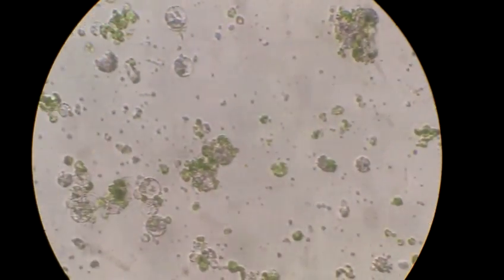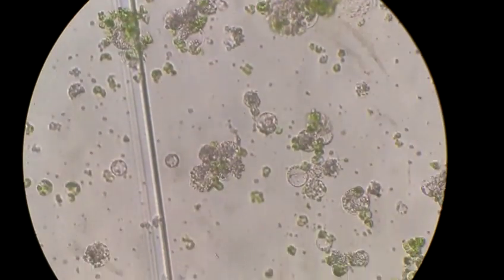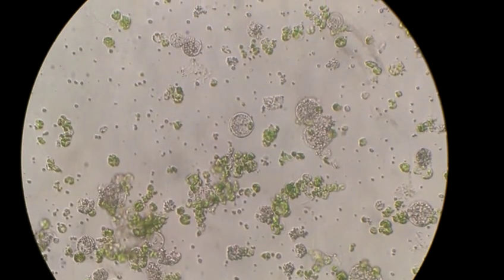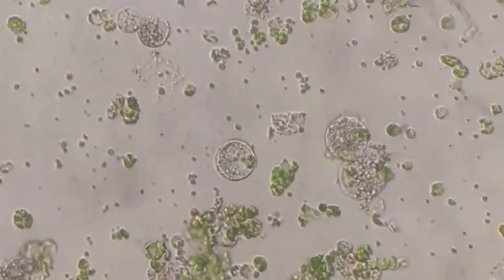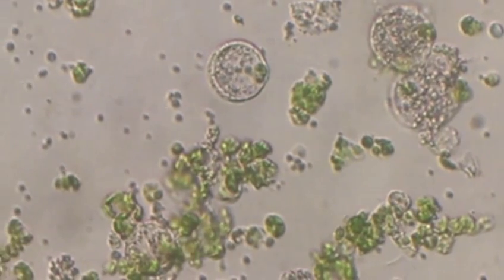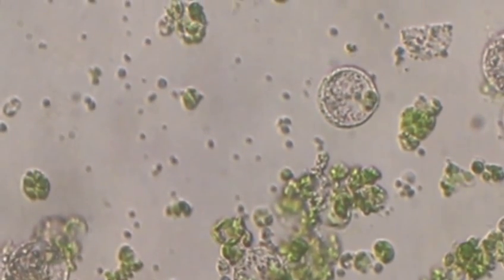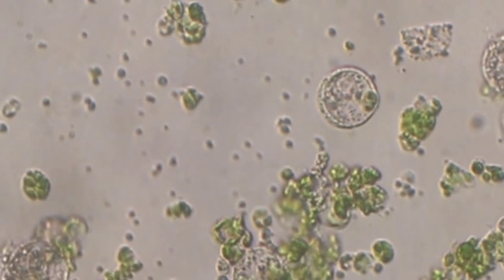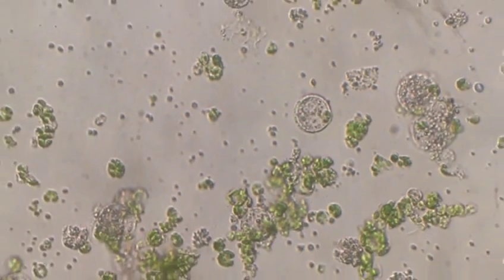The clear ones are from the grapefruit. And if we look very carefully, we can see cases where they've combined together. It can almost look like that might be one right there — it's got a little bit of green stuff in it. And that might make a cybrid, where you've got the nucleus of the grapefruit and some of the cellular structures of the pumelo parent.